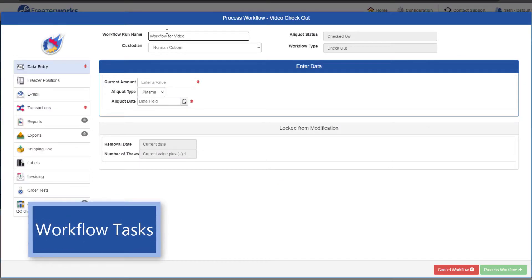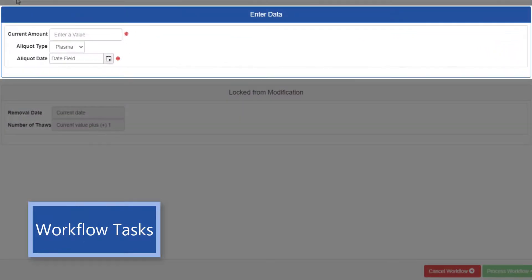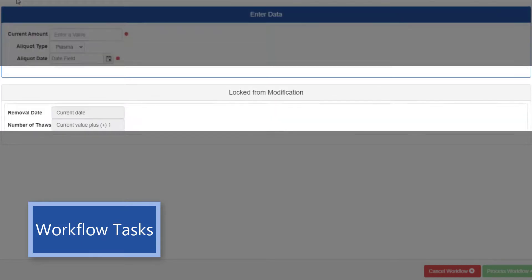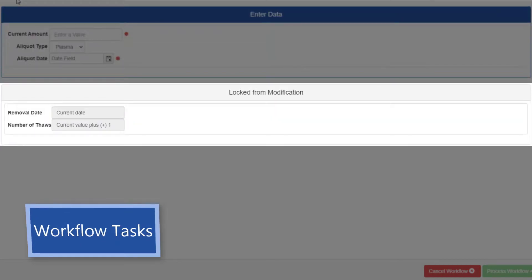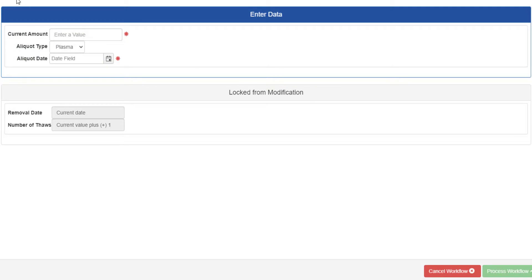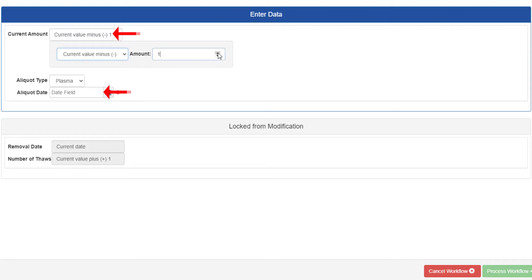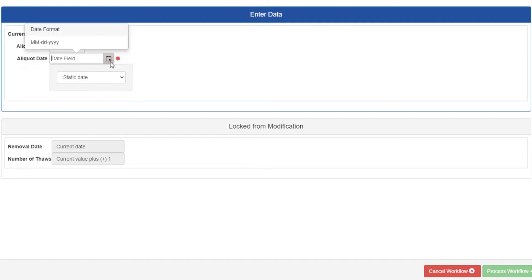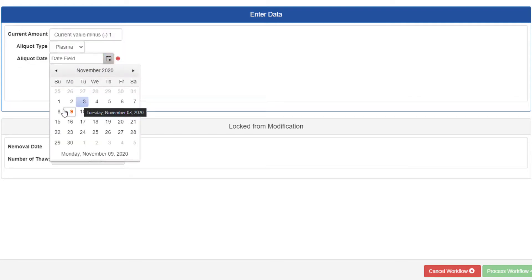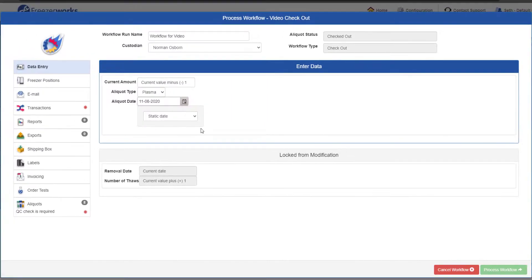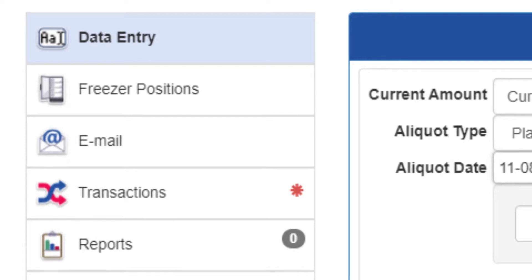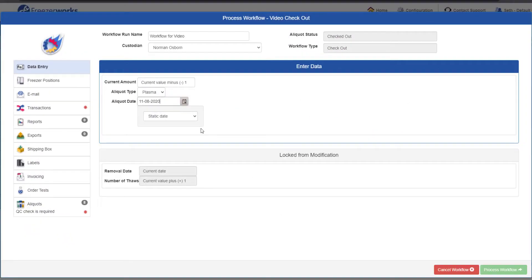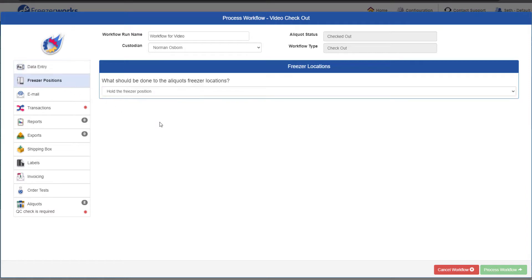First, we have the data entry page. Fields in the top box are modifiable, while the ones in the bottom will be automatically updated based on the configuration of the workflow. The fields with asterisks require entry before you can continue. When all required fields have been updated, the red asterisk on the page button disappears, like so. There may still be fields that do not require entry, but you can modify nonetheless.